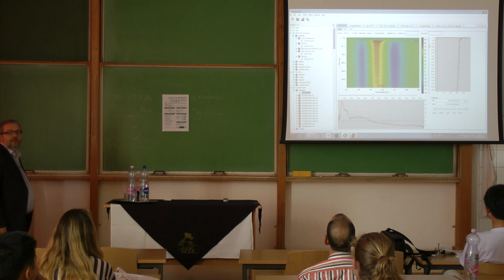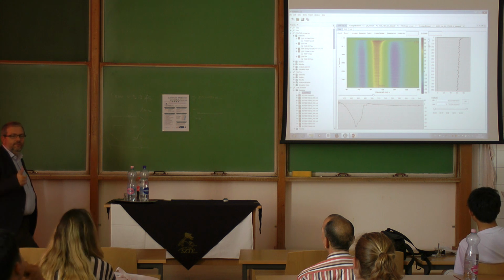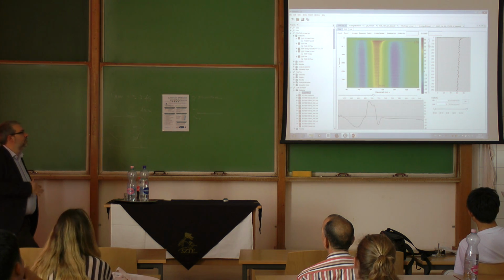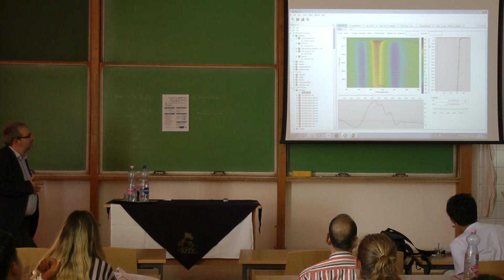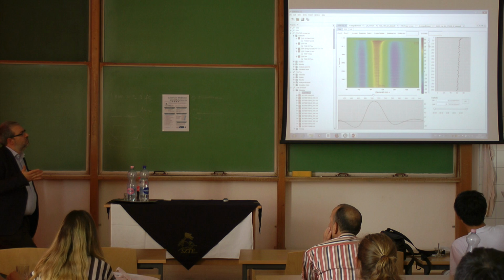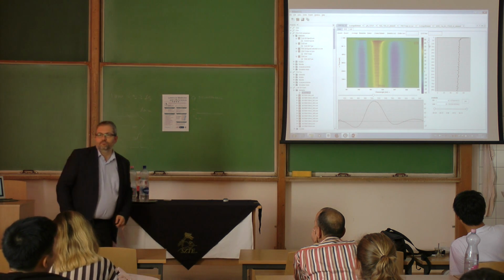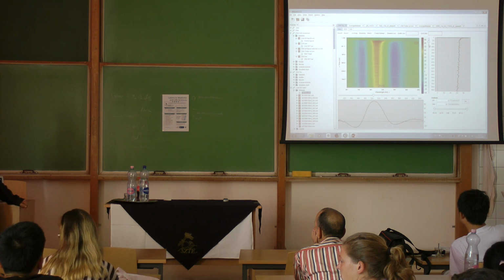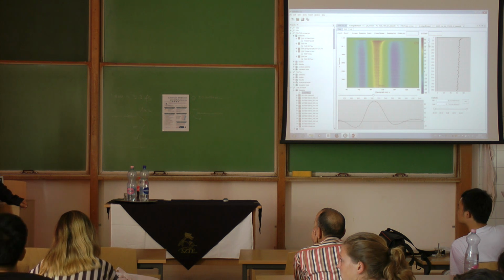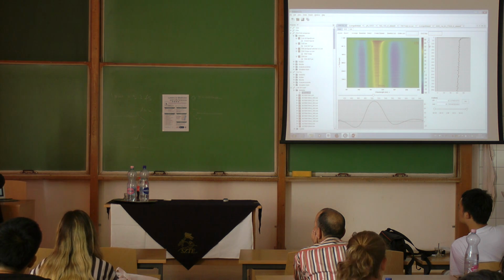So this is where you arrive. This is arriving, and it's propagating. Basically, you count your time zero from here, with the rule of thumb that you take it when you achieve about half of your signal. It's not already time zero, because it's already one or 2 picoseconds in. Time zero is the situation when they are all in the excited state, and the probe pulse arrived. Yes. So that's why we have this noise.